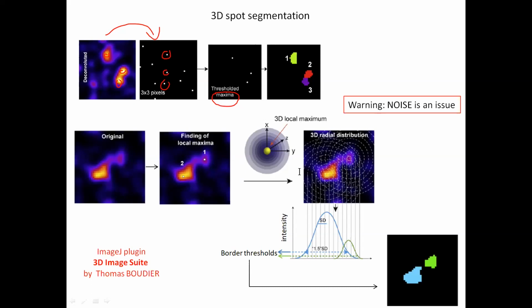Someone is asking whether I can use a dendritic marker like MAP2 to relate synapses to dendrites. Yes, if I see what you mean, you can indeed do colabeling with dendritic markers. I will not go into this example now, but especially if you're in culture, you can use MAP2 to see your dendrites, and Homer, GluR1, VGlut or Bassoon to spot the synapses.